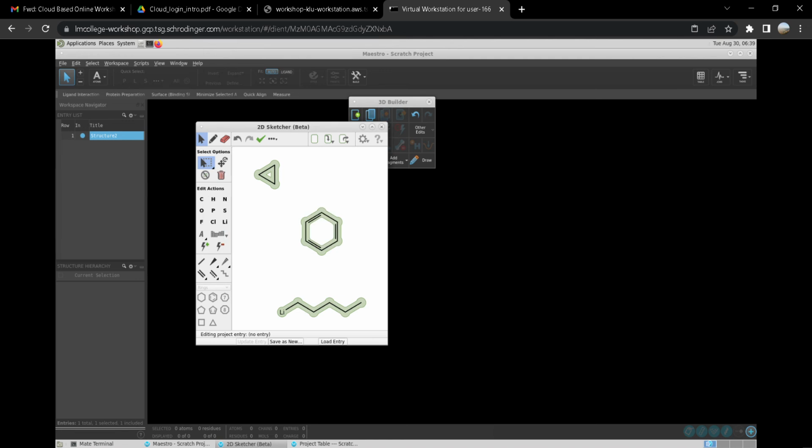So how many of you have finished sketching the 2D structure and the 3D structure? Done, that's really nice. Dipin, Dr. Bharat, Meghna have finished. Shivastava, Navneet, thank you, it's very much appreciated. Some of you may take time, so don't worry about it.